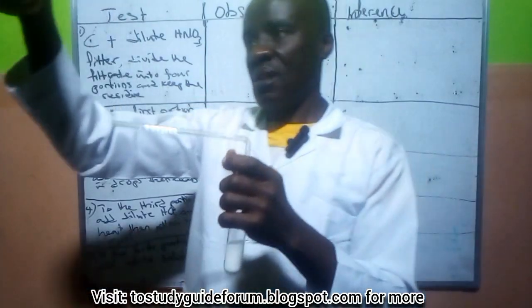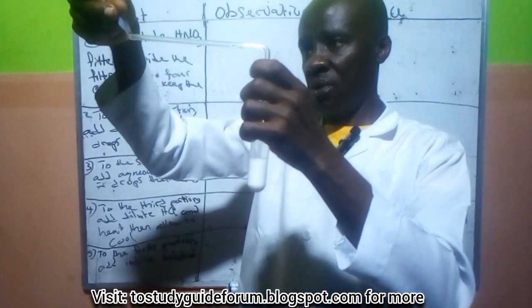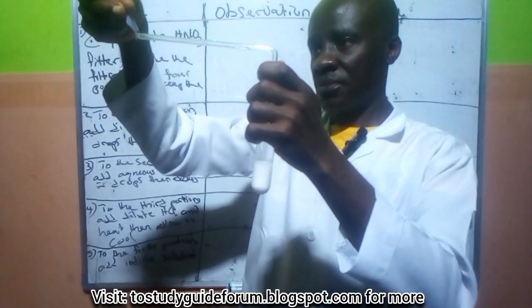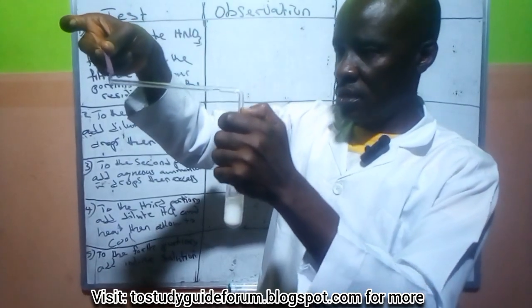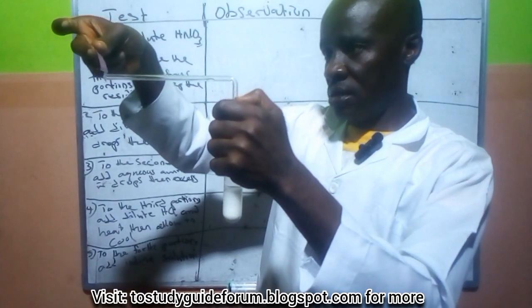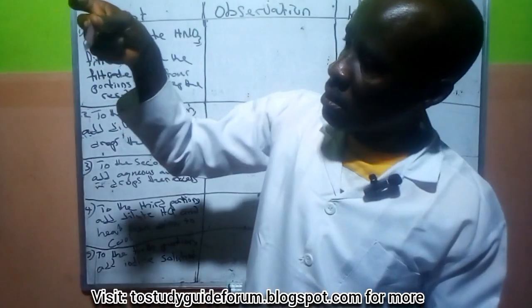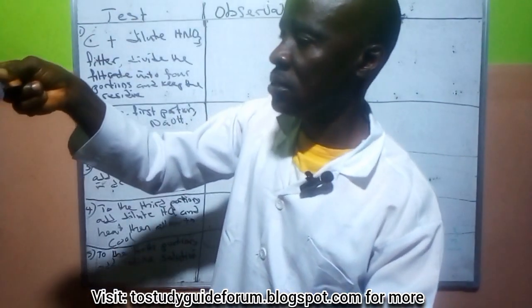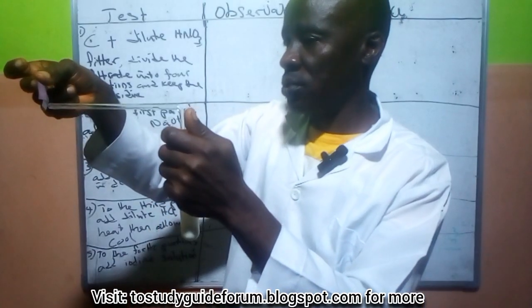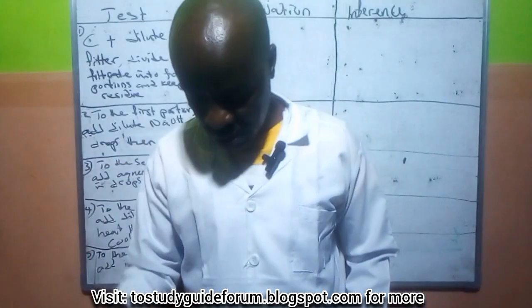I think it's because it's a weak acid. The color is faint. I don't know if you can see it there. This is the blue, this is the red. There's a little faint color here, and this is enough to let us know that this is an acidic gas. So let's just save some time. Yes, there's a slight reddish color at the tip of this. I think that should be because this gas is actually a weak acid.